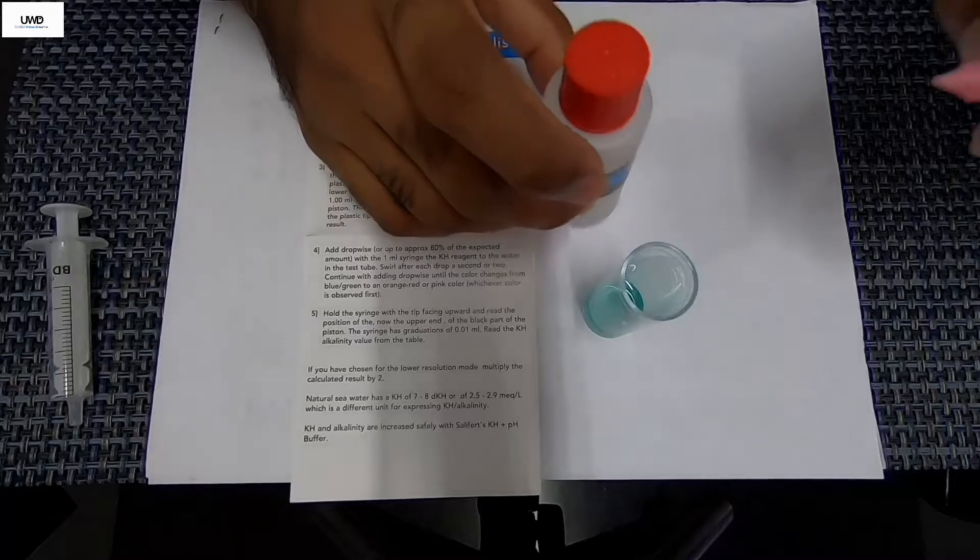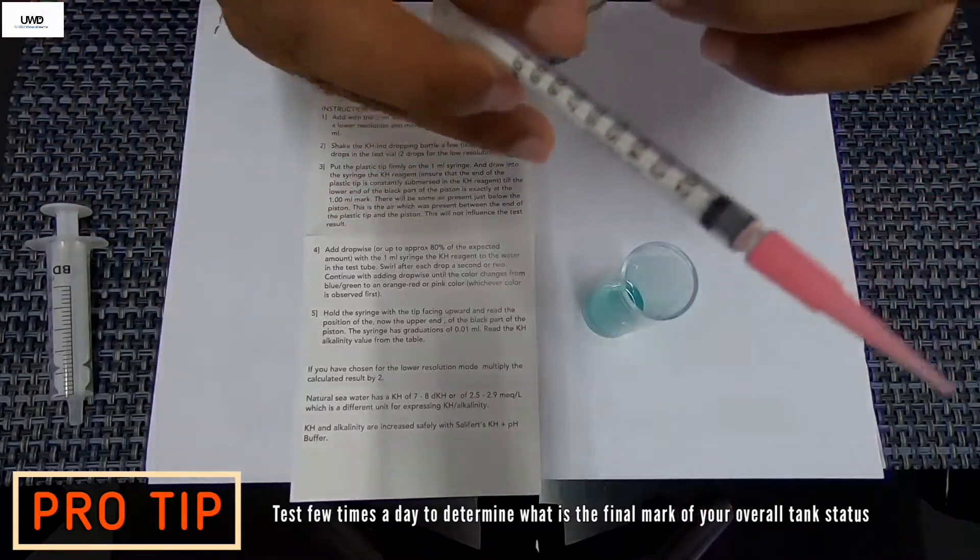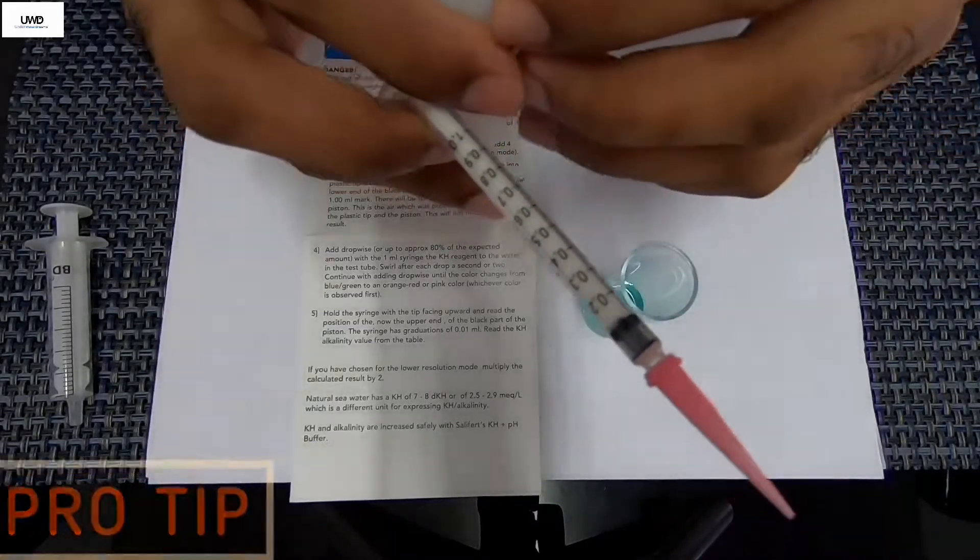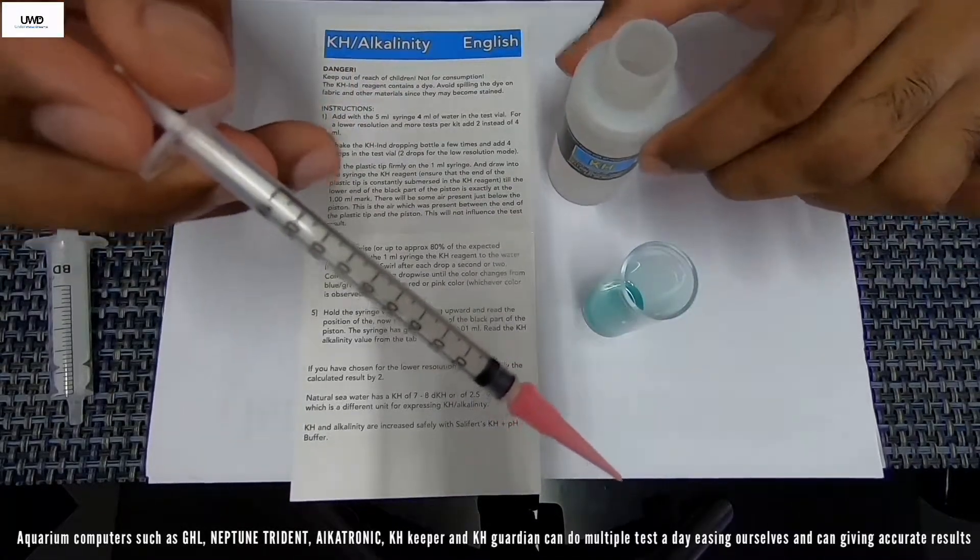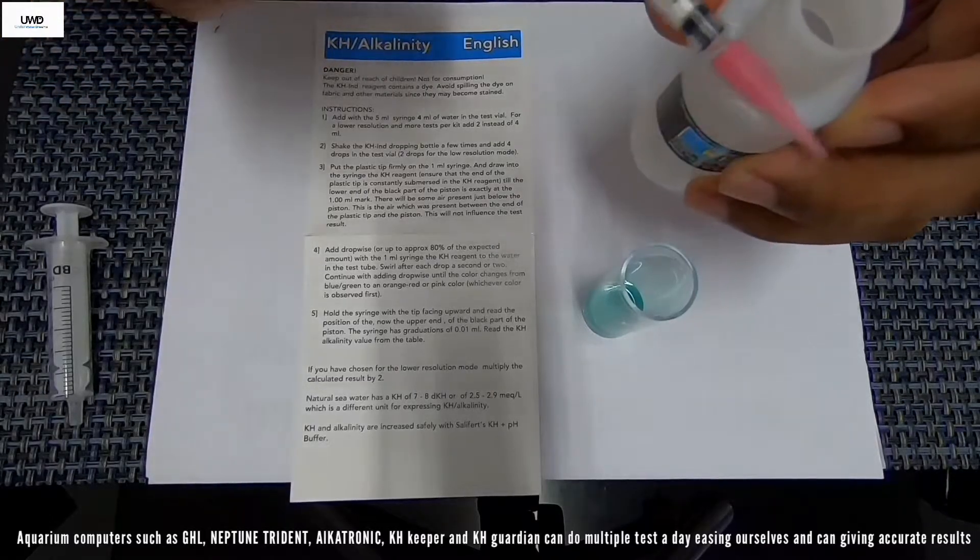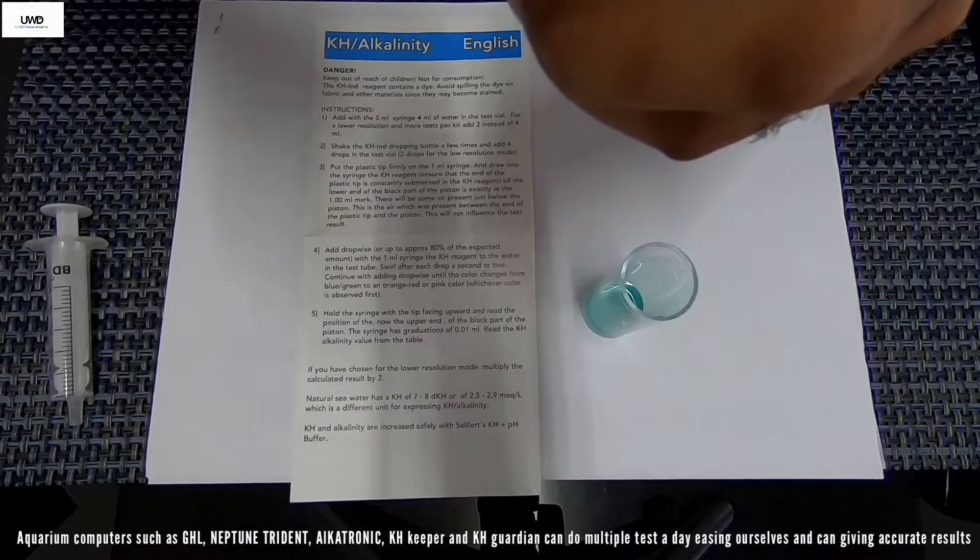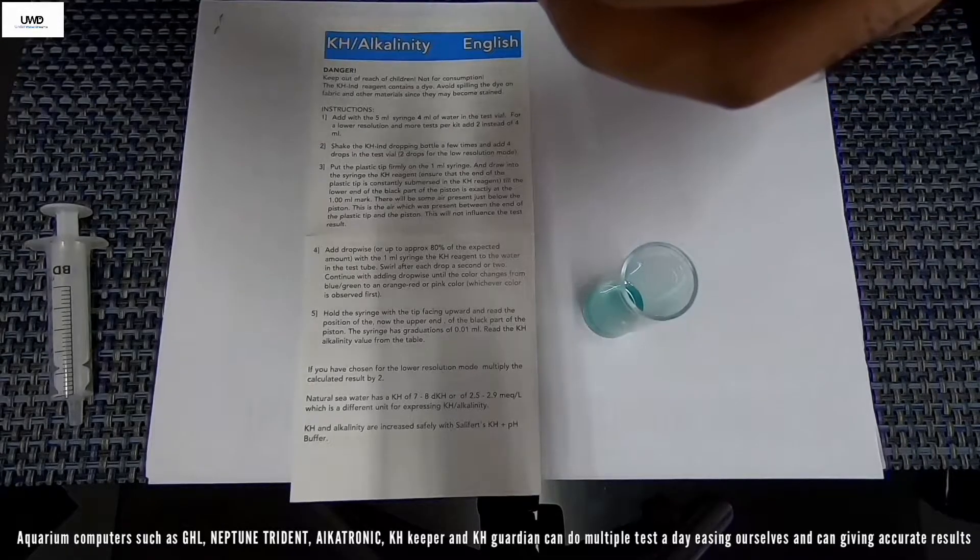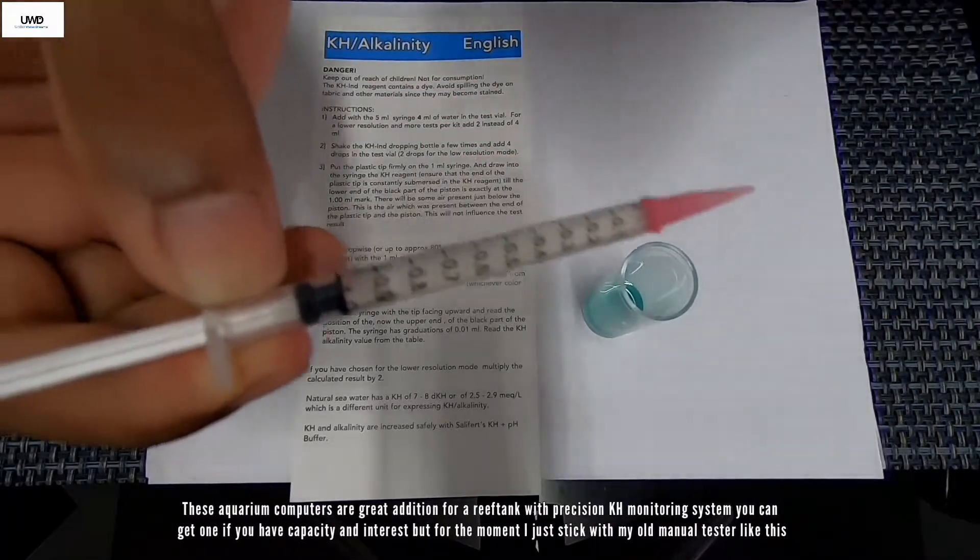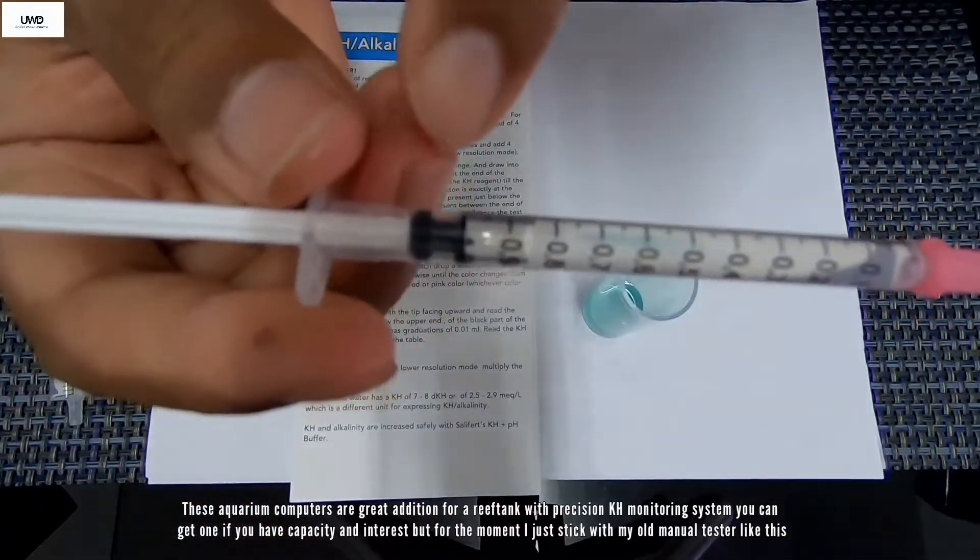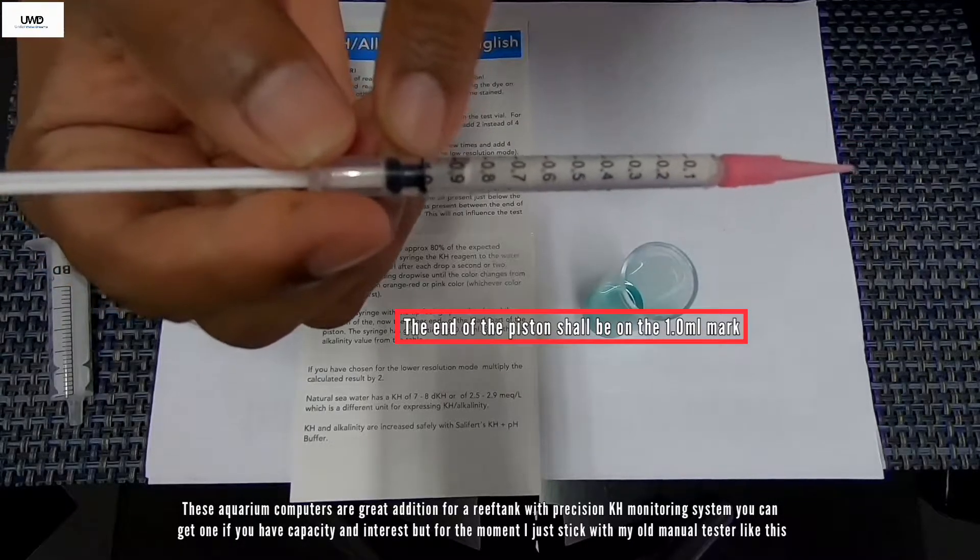The last part is using this reagent, the 1ml syringe, the thinner one. What you're going to do is draw this reagent inside this syringe until the 1ml mark. And remember to draw this liquid, that's a trick. And always grip this container very tightly. Put aside the reagent.